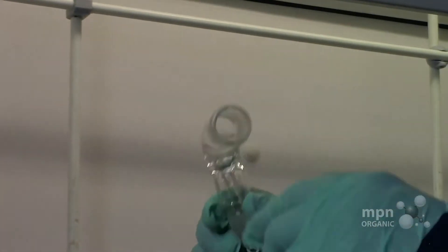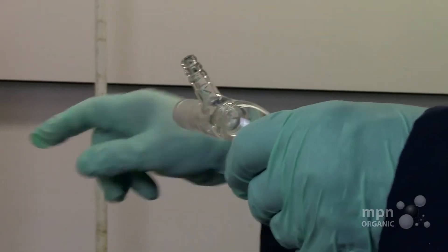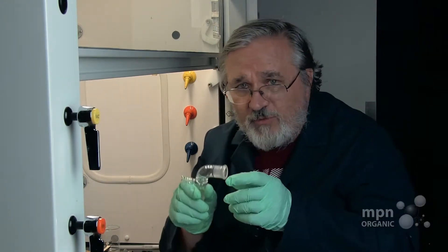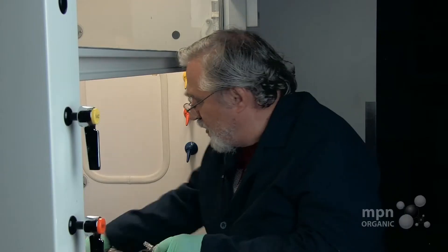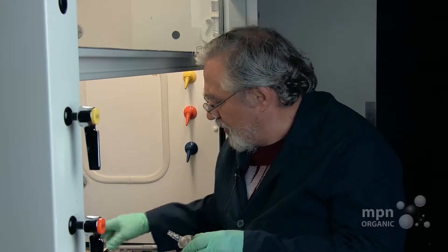This is a very expensive piece of equipment only because it's a tube within a tube, just like the condenser here. So we have to be very careful when we handle this, and we also have to be careful that when we connect this to the apparatus it doesn't come off. We're going to be using what we call Keck clamps — you have four of them in your equipment.